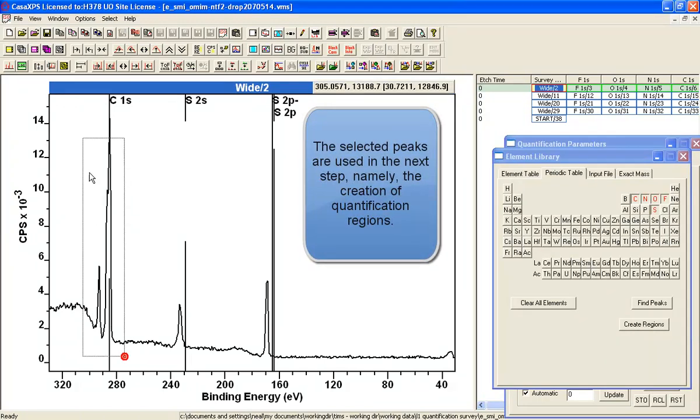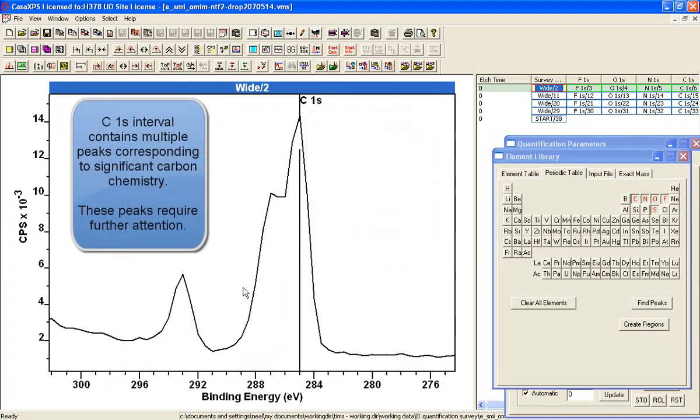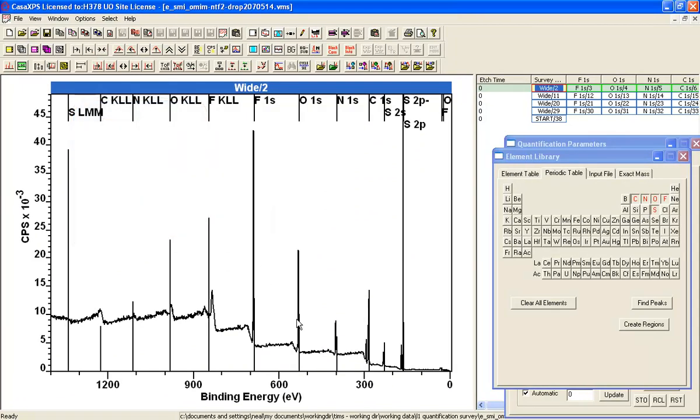There's a Carbon 1S, and the Carbon 1S has some structure here, so we have to bear that in mind when we create a region. And let's see now, if we look through the set, you can see that the Sulphur has a corresponding Auger.